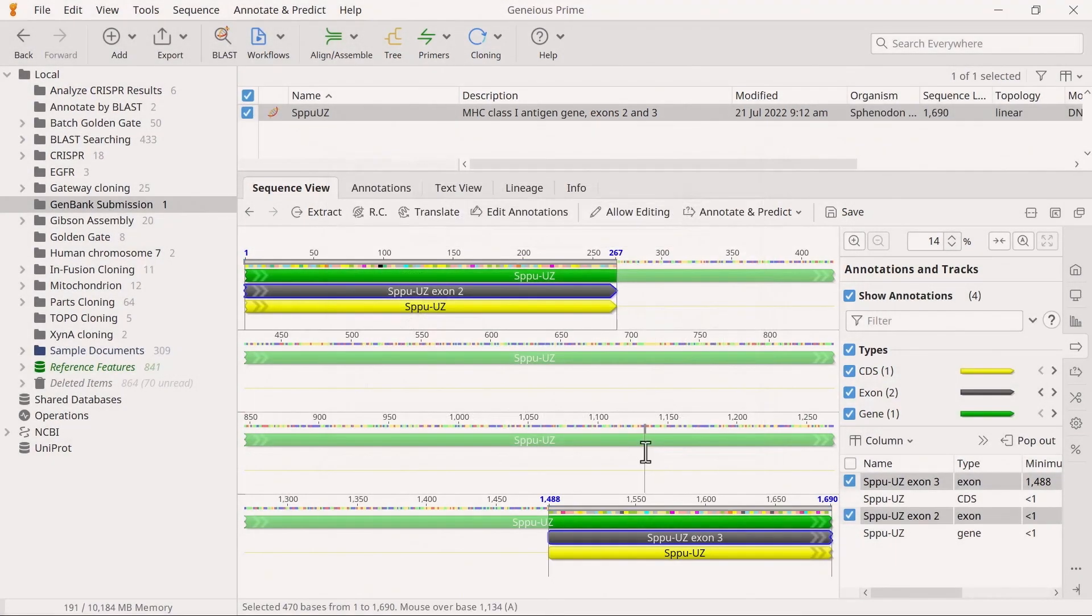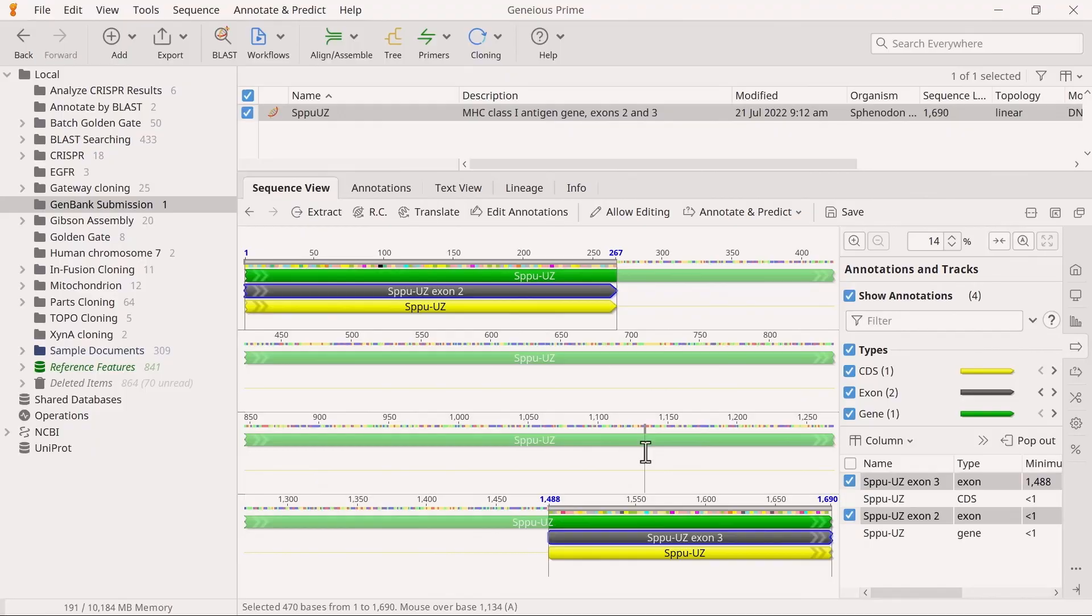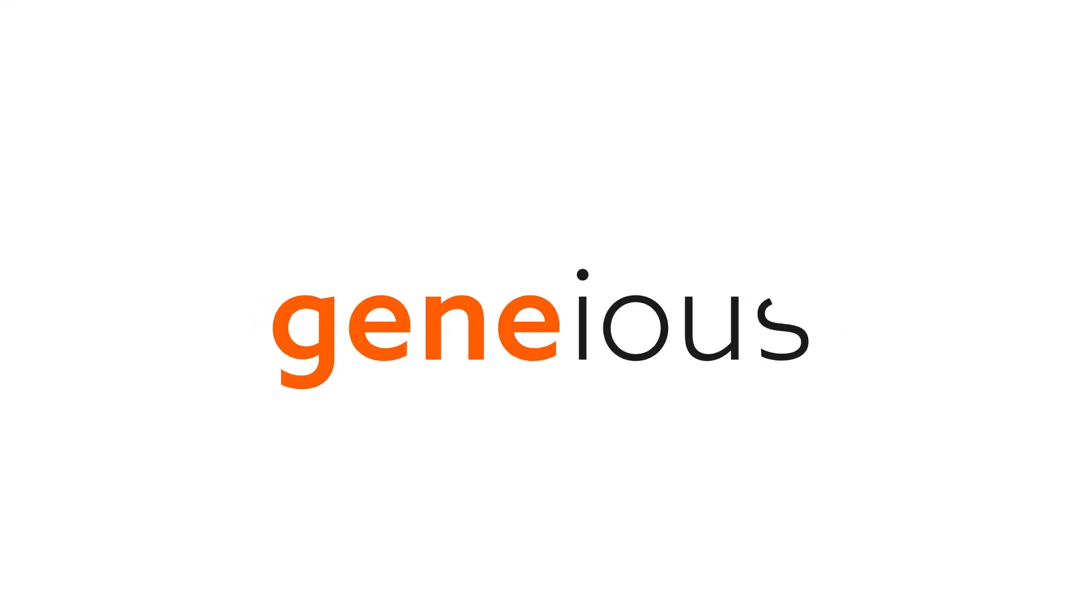And that's an overview of adding the required qualifiers to a protein coding gene. You are now ready to submit your sequence to GenBank. To learn more, visit Geneious.com.